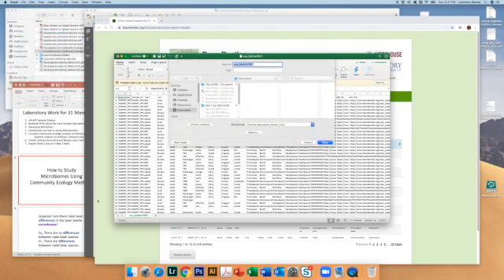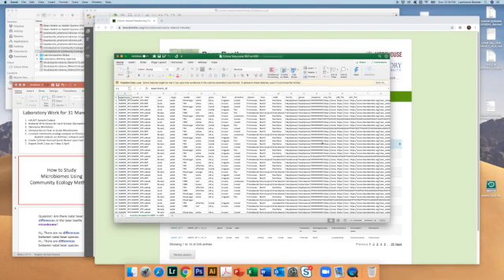And so in this case, I'm going to rename this colony sequence black-eyed pea versus Adzuki, so that I know what it is. And rather than putting it in my download folder, I'm going to actually put it on my desktop where I'll be able to find it. Potentially, I'll be able to find it more easily. Okay, so that file's there.